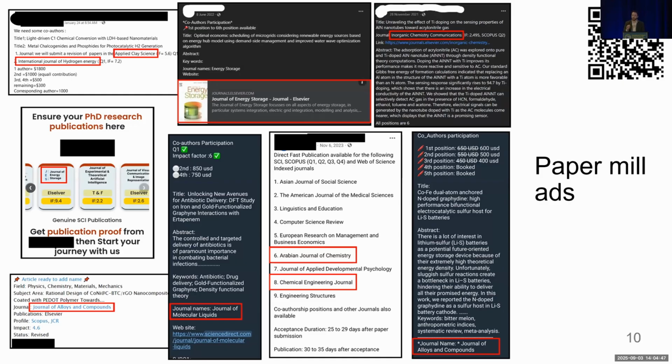We could only assess the instances for which we had sufficient information to make a determination. If the metadata banners aren't in the article, the rate of SEM misidentification is entirely unknowable. So I would venture a guess that the true rate of SEM misidentification is lower than that 1 in 5 figure, but we would need that metadata to know for sure.